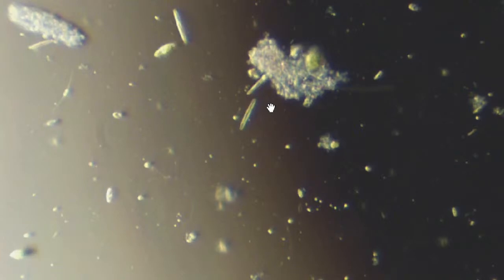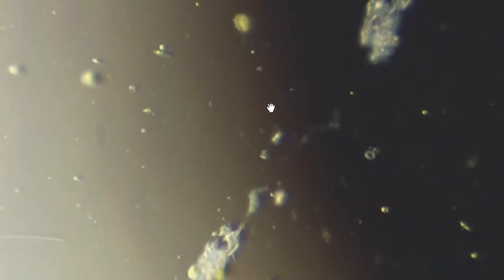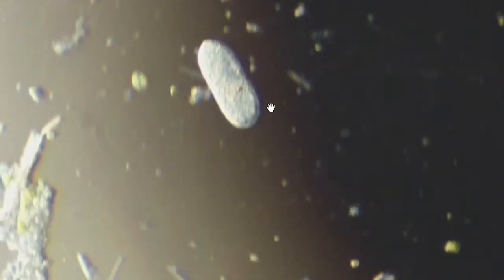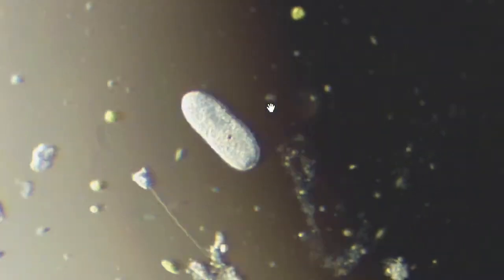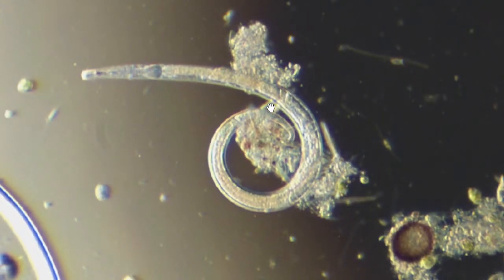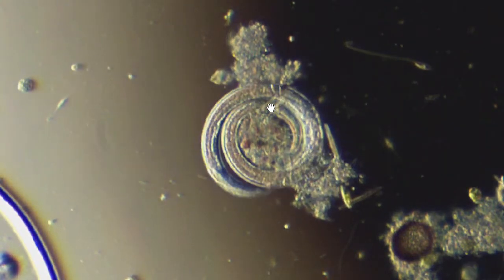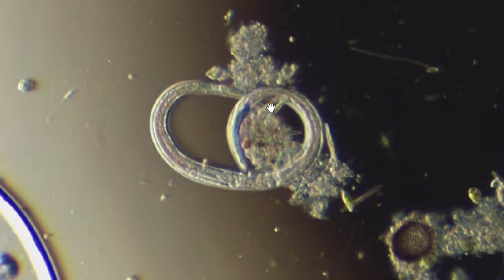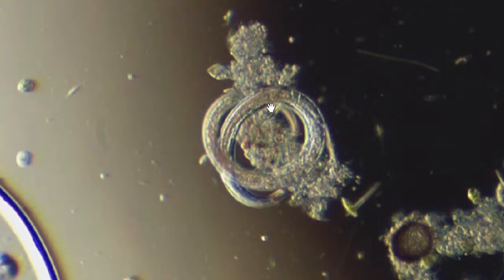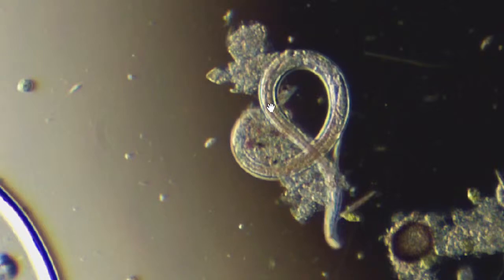I always make sure to collect some detritus. Another. Oh, look at that guy. I've seen one of these before too, and I forgot which one this is. Look at that. Beautiful. Oh, there's a nice coil. Sometimes they do this. You get the nematodes coiling up like this, but you can really see the structure inside. Look at all the details. When they stop moving for a bit, you can really see some details. Nice little coil. Make a pretzel.